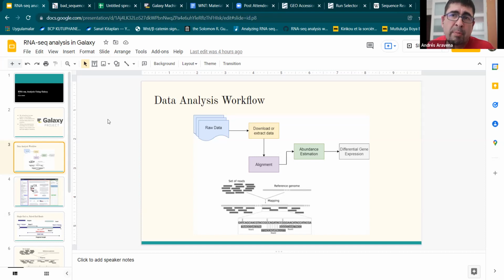And that you can do with public data. Somehow you design something that is similar, or you simulate data, and you can do all this exploration in Galaxy. And eventually, when you are happy, you are finished, you download the script, which is the protocol, and you can run it locally with your own data at the end. But you don't need to do the exploring of the protocol on your computer. You can do it in the cloud, no?